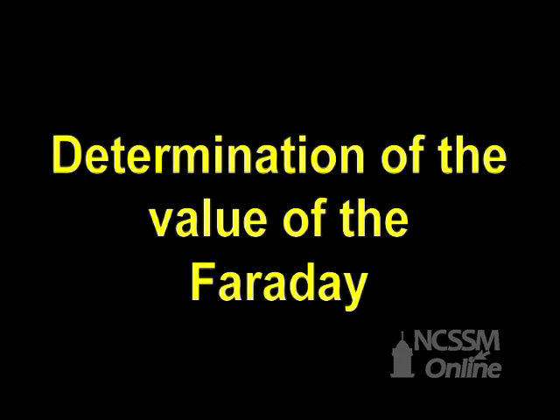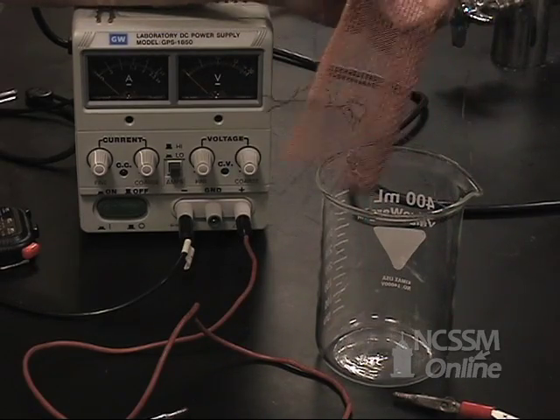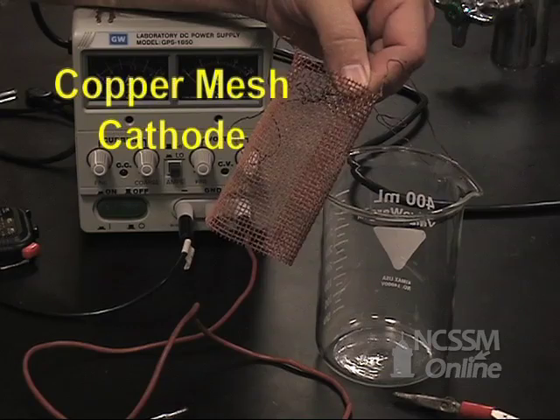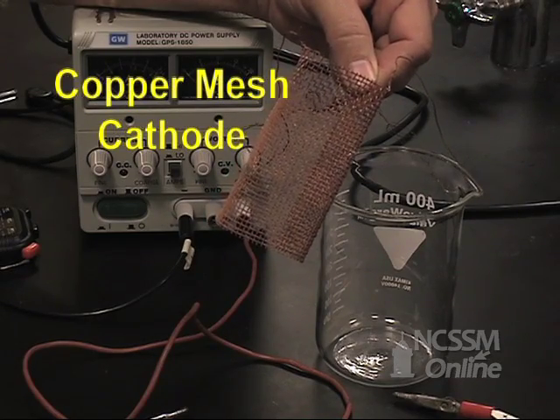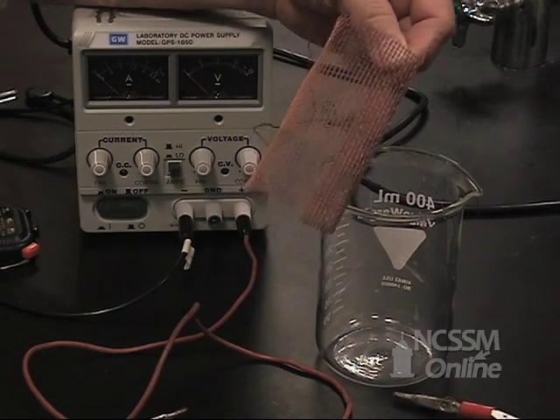We're going to determine the value for the Faraday by electrolyzing a solution of copper sulfate. We have a copper mesh electrode, which is going to be our cathode. We're going to plate copper metal onto the wire mesh.